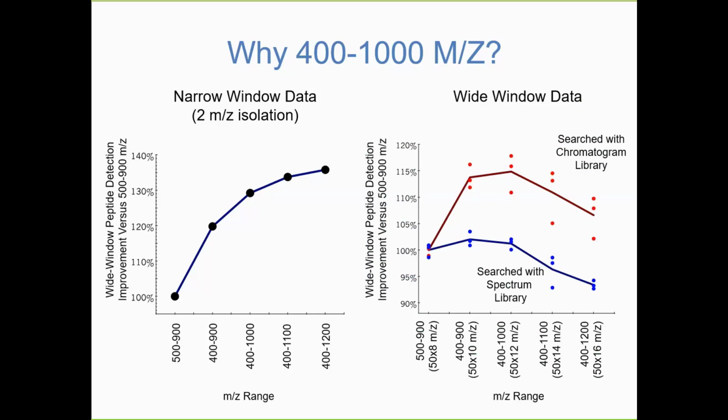We find that acquiring data up above that range can be useful in certain circumstances, though, if you need to measure specific peptides.